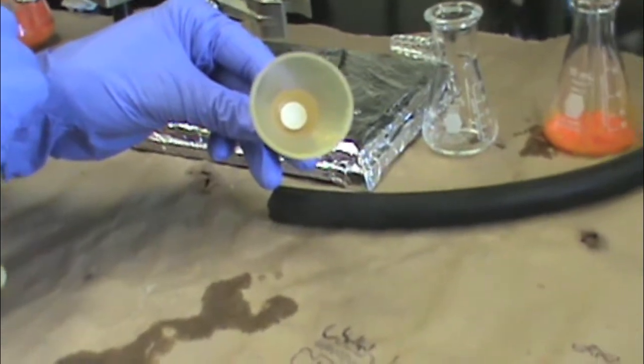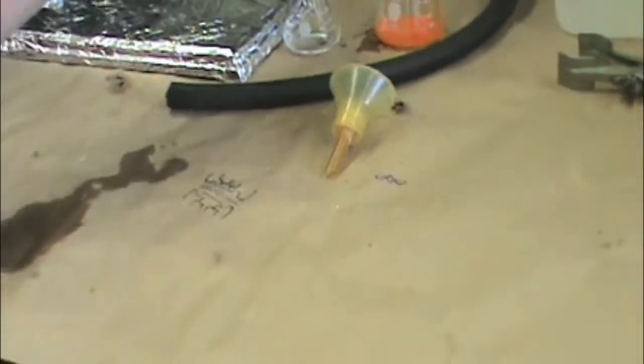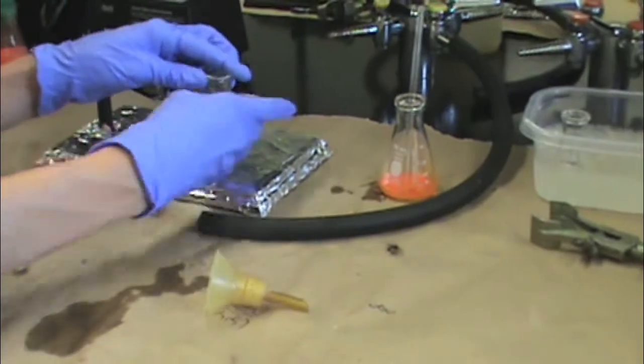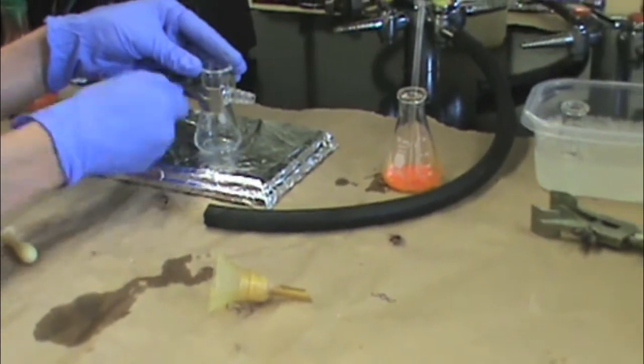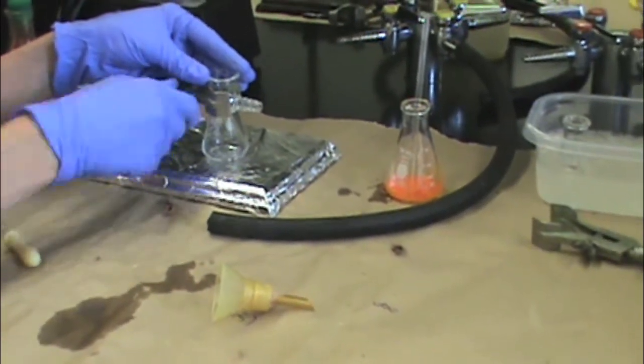You won't need any paper for this filtration. You are going to clamp your sidearm flask, making sure that it is tight and won't fall over.